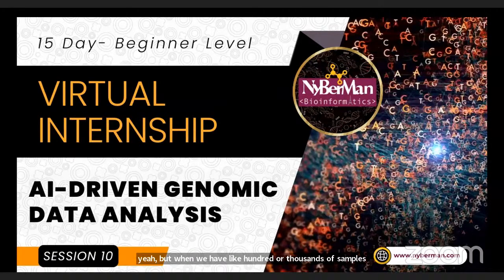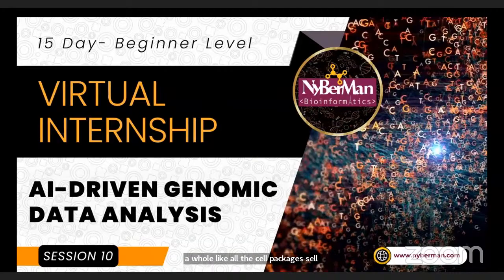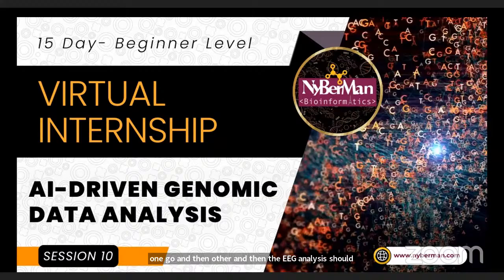and you want to run a batch analysis, all the CEL files should be read at one go, and then the analysis should be done for all the files or samples in just one go, in one batch. That is what we call pipeline following, or executing the pipeline. So in that case we need more computational power. But right now we are dealing with small samples, so you need at least 8 GB RAM, and that will be enough for your machine.